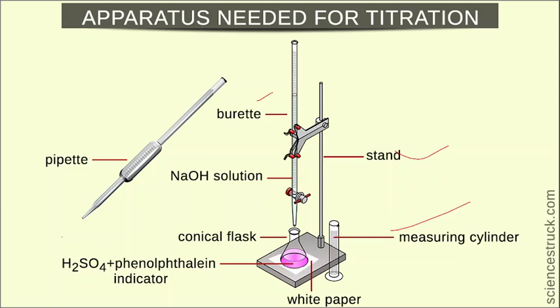And in this case, they made use of sulfuric acid and then phenolphthalein as indicator. And then yung pipette, do not forget to transfer the volume of the solution needed. And then lastly, your titrant. So, hindi nakasama si aspirator. Isama na lang natin, drawing natin siya.